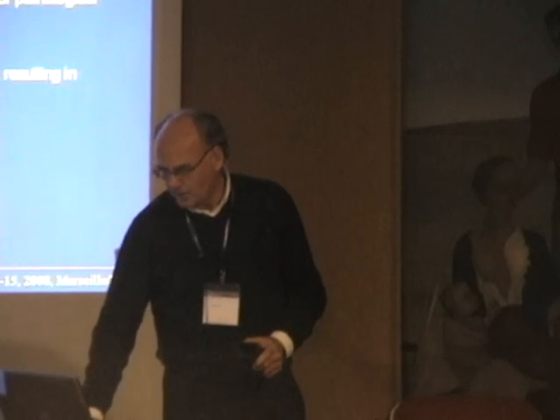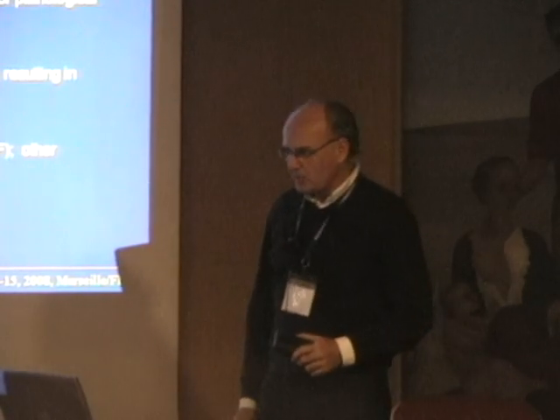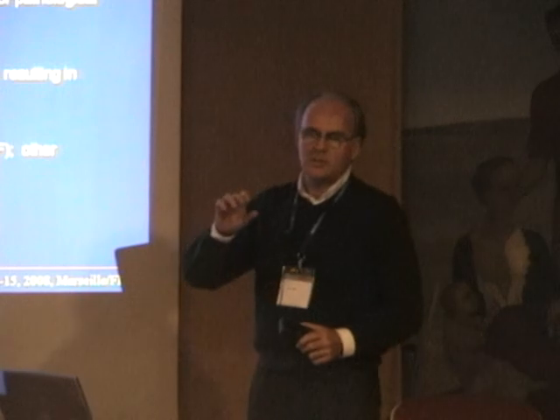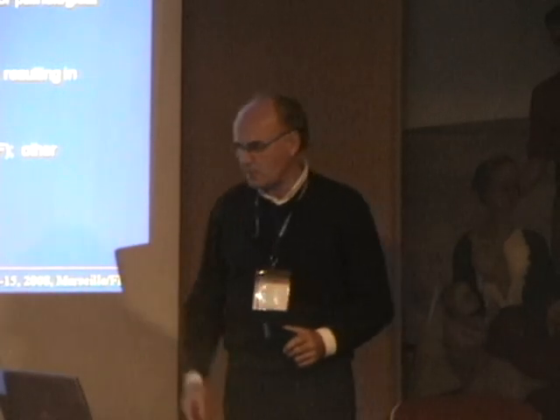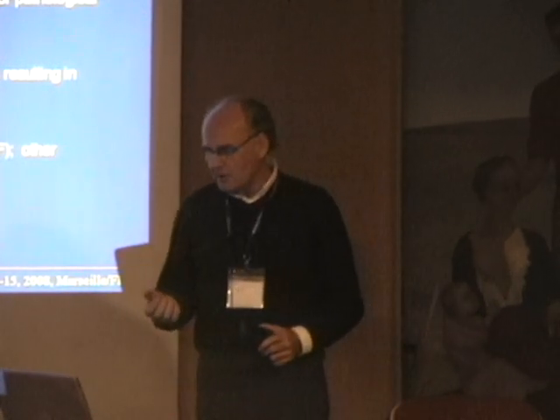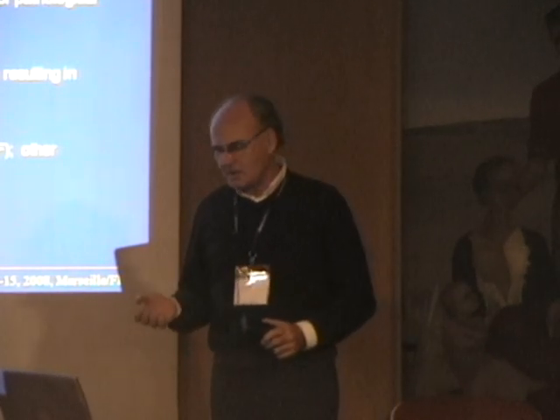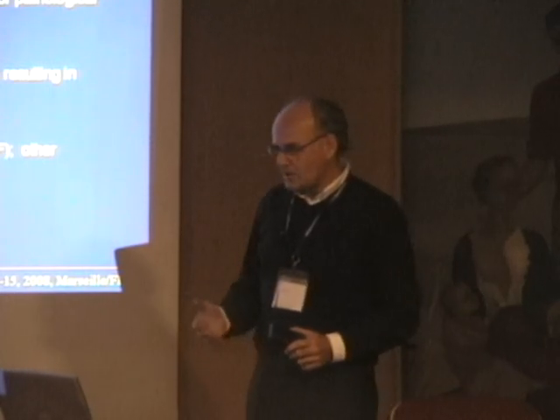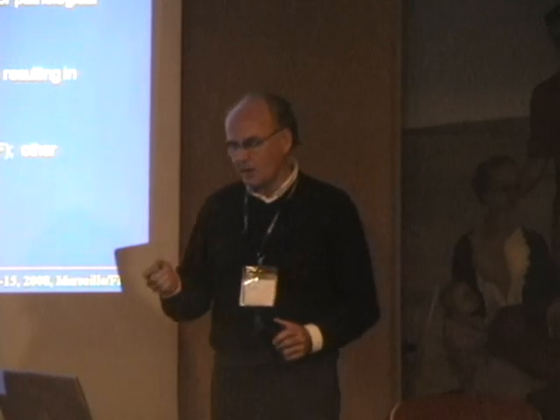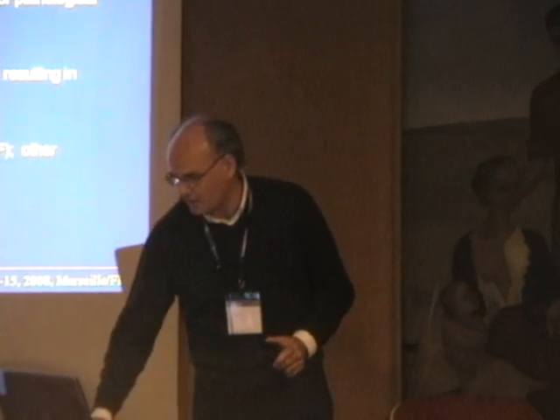Here there are a few important methods that exist. I'm not talking about 1 and 4. There are some special cases, but about 2 and 3, which is first the spectroscopy of excised tissue, tissue that you excise from an animal, and then you do the spectroscopy without further processing, basically, and tissue extracts. That means you perform a physicochemical procedure on tissue that finally results in metabolite solutions. The latter method can be done in just about any tissue type, and you can see metabolites that you cannot see in more or less intact tissue, while method number 2 shows you only those metabolites as visible as they are in vivo.